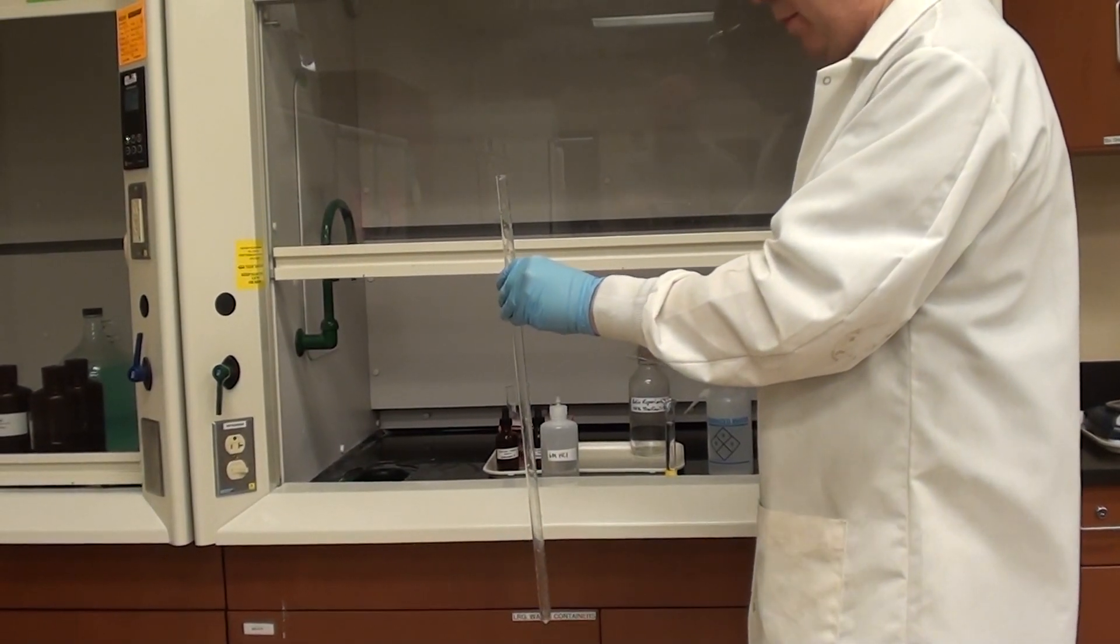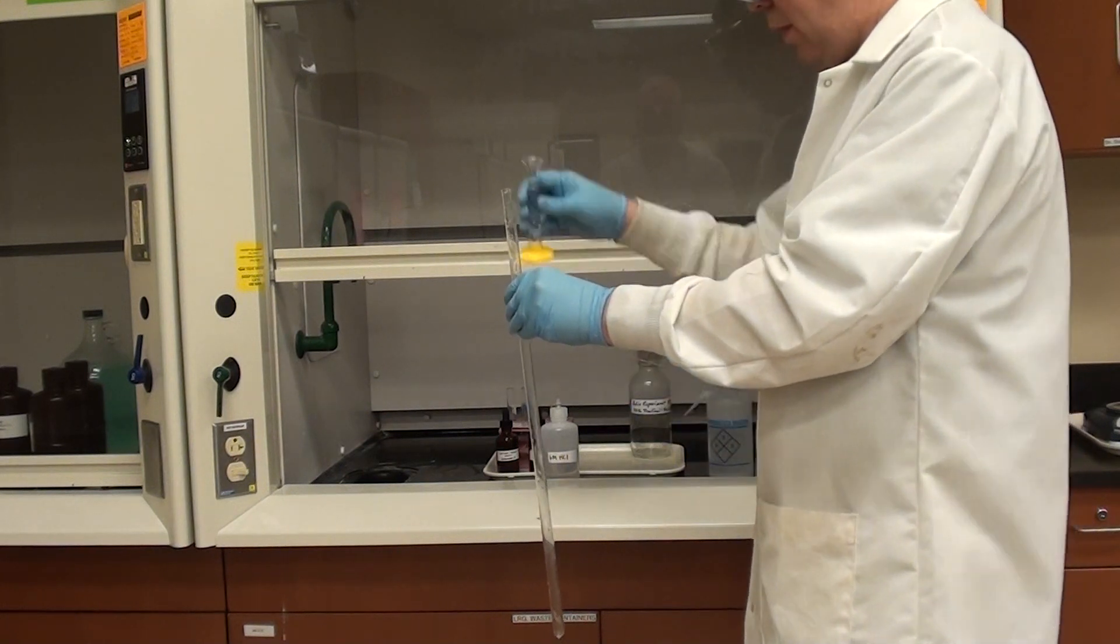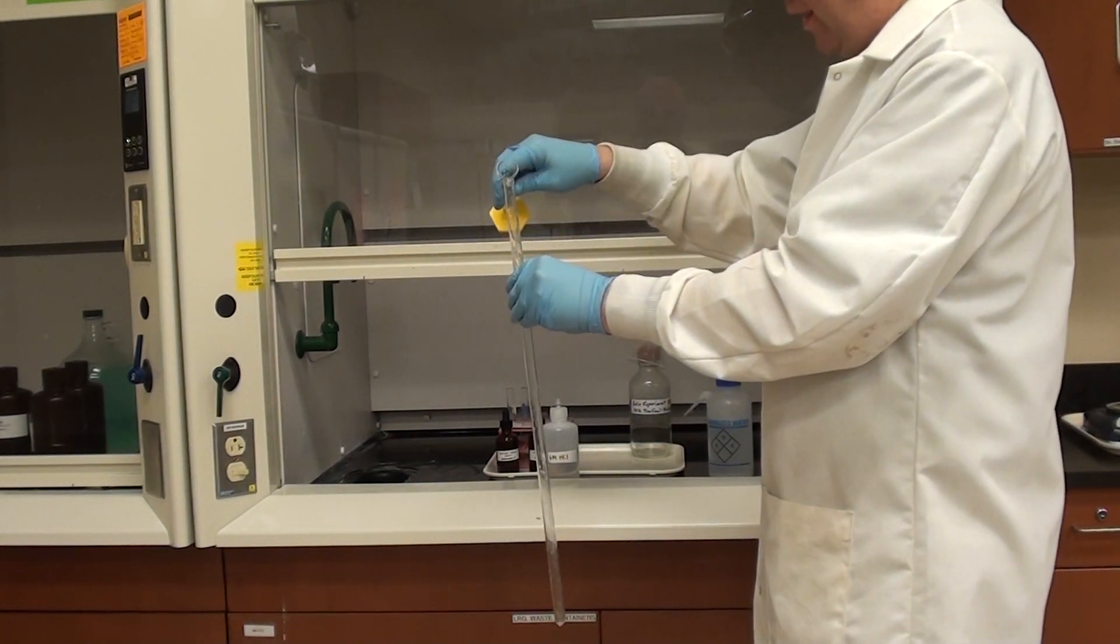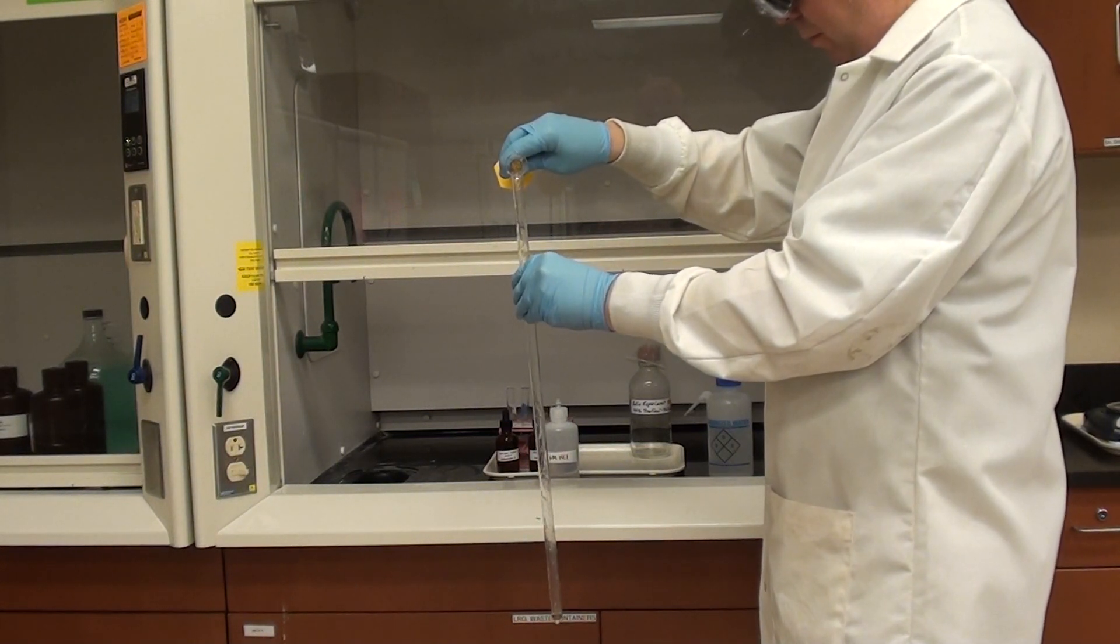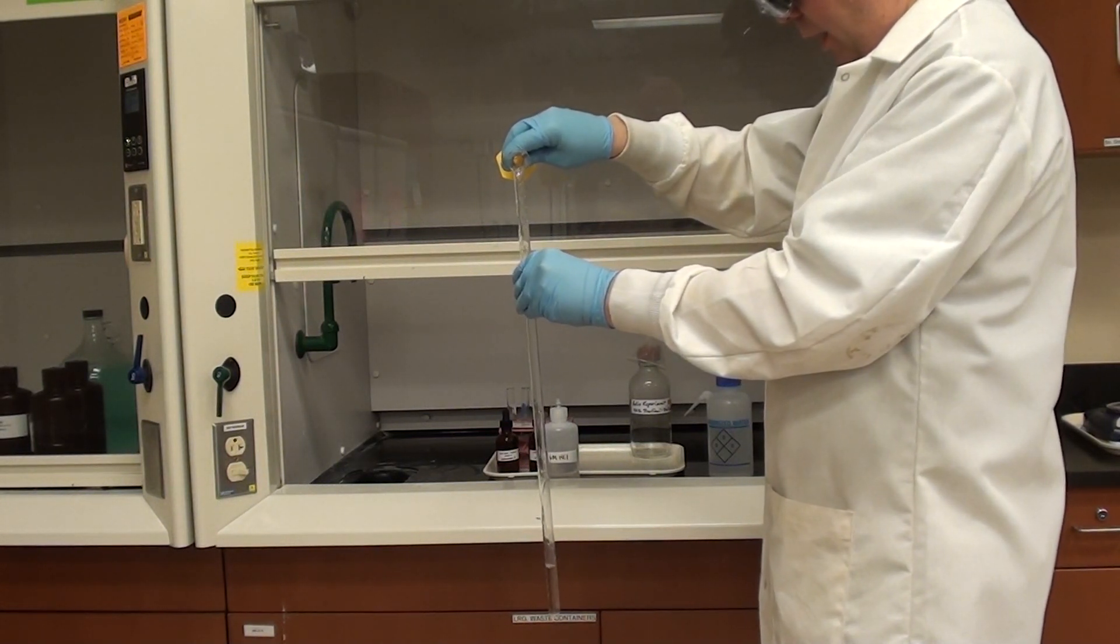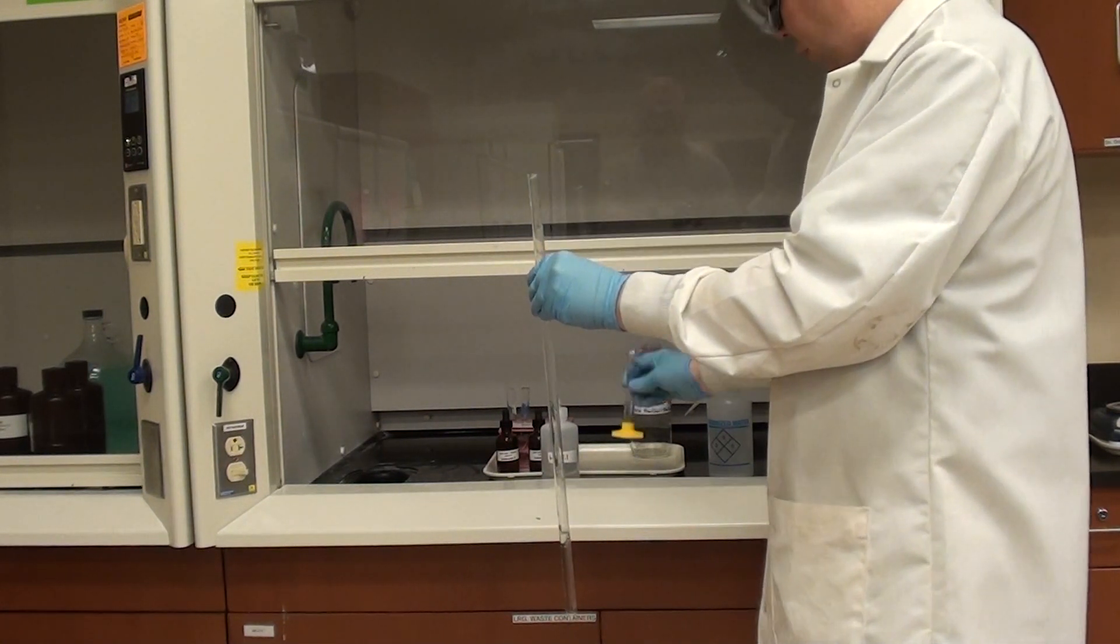So we're going to add some 6 molar HCl to the eudiometer tube. And this is 10 mils. It's not as bad as 12 molar but I still like to use it near a fume hood. So I'm just going to go ahead and add the 6 molar HCl like this and it sits in the bottom of the eudiometer tube.